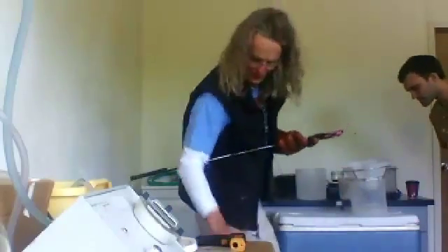Would the extractor want to have a ventilation mask on, not only to get oxygen, but to keep the alcohol vapors and other... Okay, doing a selfie, guys, so you get to see this. Yeah, keep going, bro. Okay, here we go. We're seeing this here. This is winterization. The temperatures are very, very low. Let's have a look. Okay, temperature is low. So that means it's way over minus 65. So there we have it, winterizing through there. I'm going to be putting it away now.